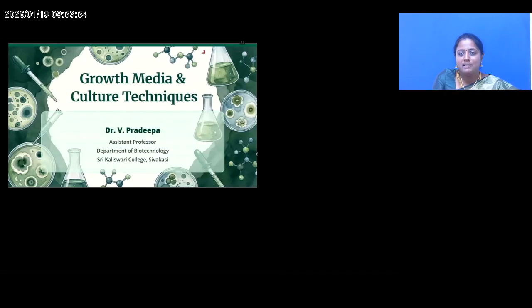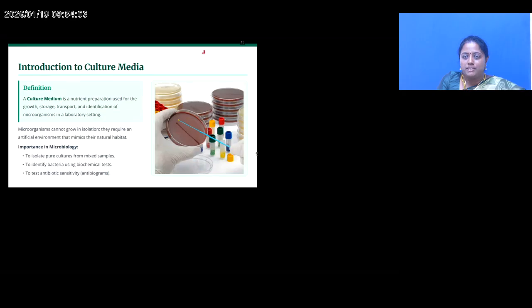Dear students, now we are going to see about different types of media and culture techniques that are available in the microbiology laboratory. Before that, let us see the introduction to culture media. A culture media is a preparation giving nutrition that is used for the growth, storage, transport and identification of microorganisms in laboratory testing.